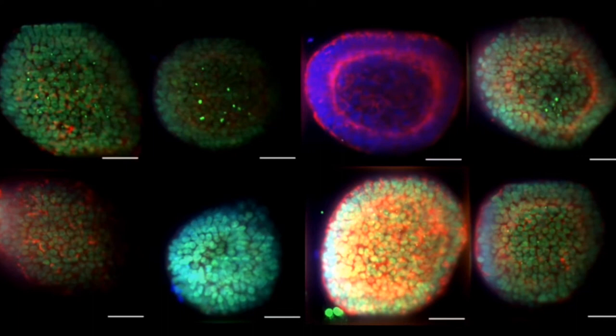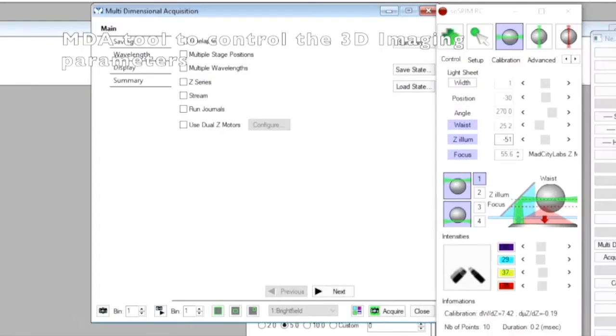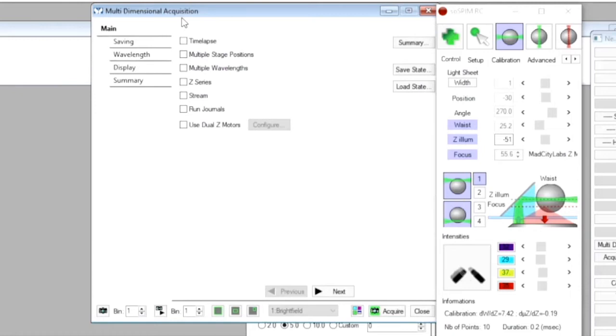Before imaging our spheroids live, I will show how we can easily perform a 3D multicolor acquisition on a single well. For that, we are going to image 200 to 300 micrometer wide cysts made of stem cells that have been fixed and labeled for DAPI, the differentiation marker SOX2, and the actin signal. Those cysts have been seeded into 400-micrometer wide G-wells the same way we seed cells to create our spheroids. To handle any multidimensional acquisition, we will now use the multidimensional acquisition tool of Metamorph.